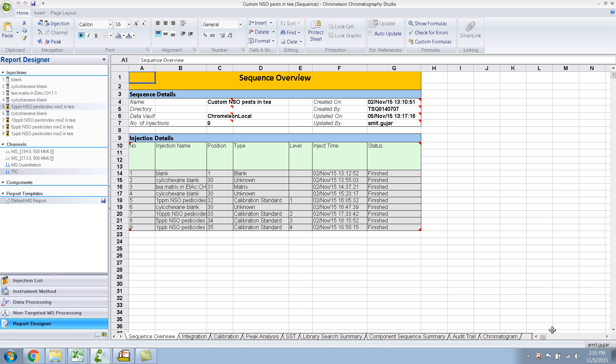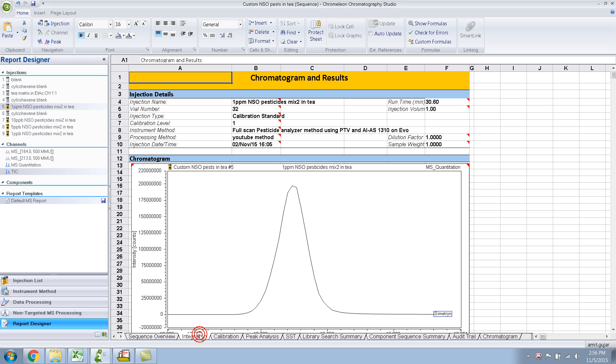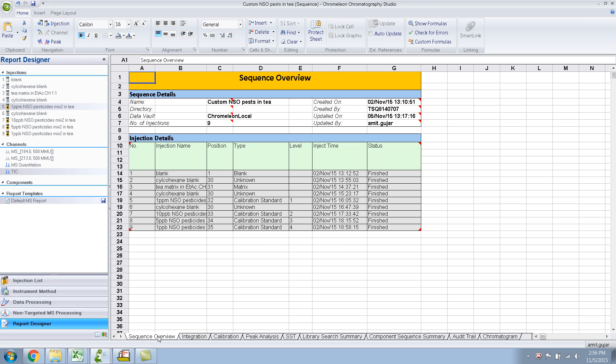So as soon as you do that, it gives you a few reports or like few tabs where you can choose your reports. Now this is highly customizable, as you can see, it looks just like Excel. And if you don't want a certain tab, you can delete it. Or if you want to add some more information in your report, you can do that. So let's go one by one about what's there in the default MS report.